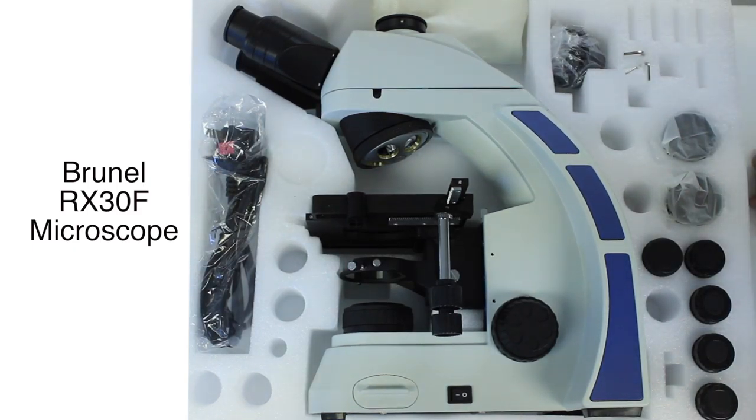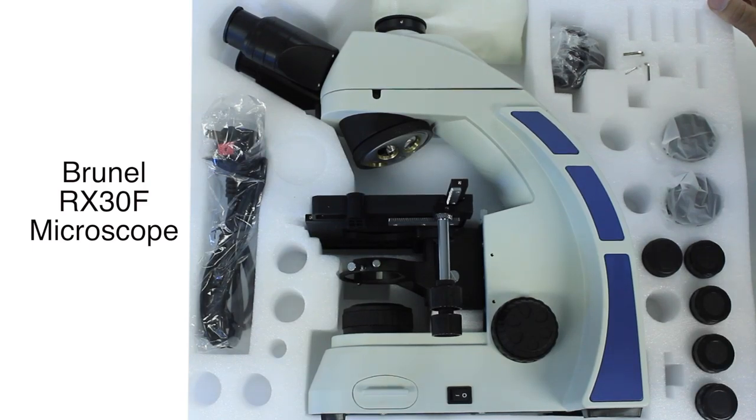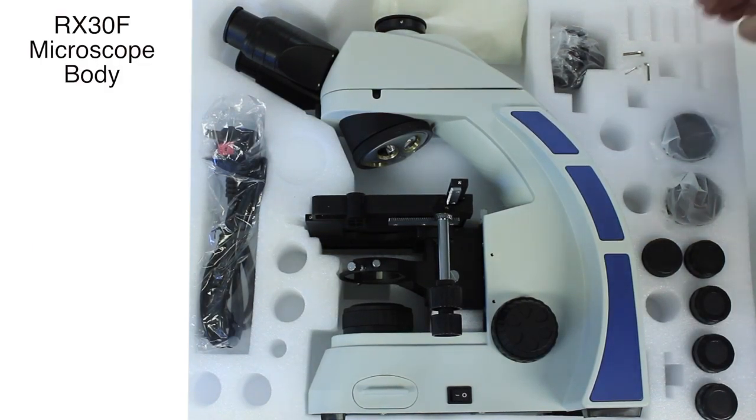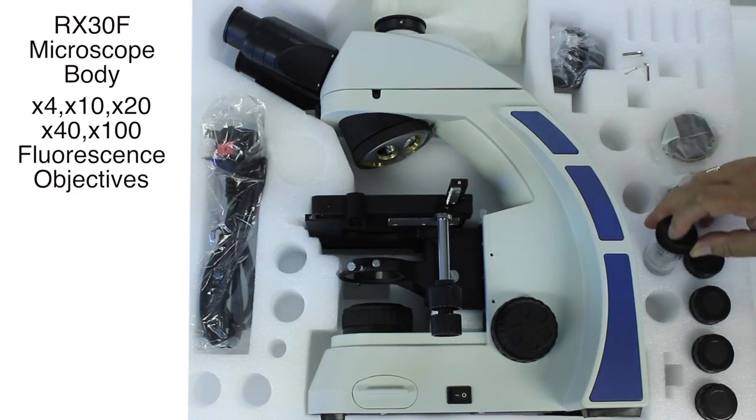The RX30F comes in two components. Here we have the main microscope body and here are the specialized fluorescence objectives.